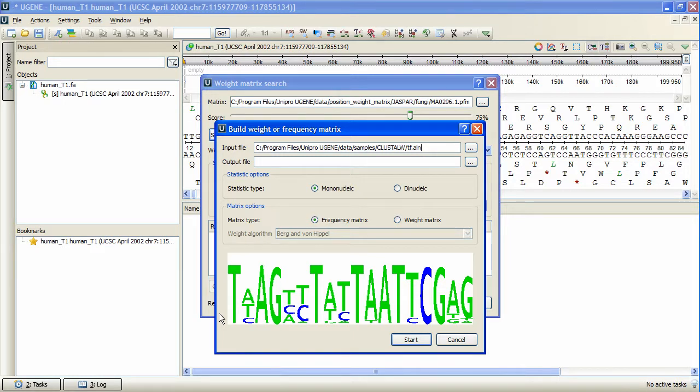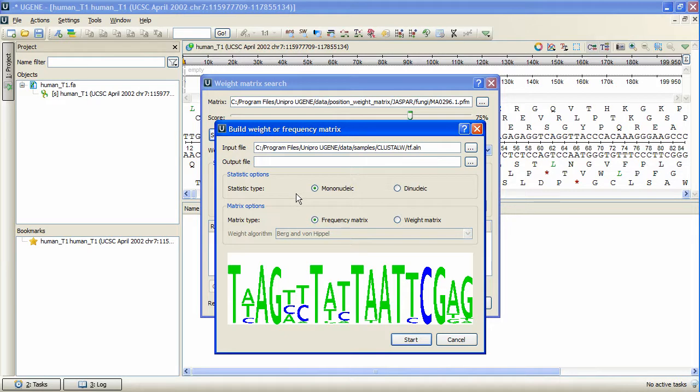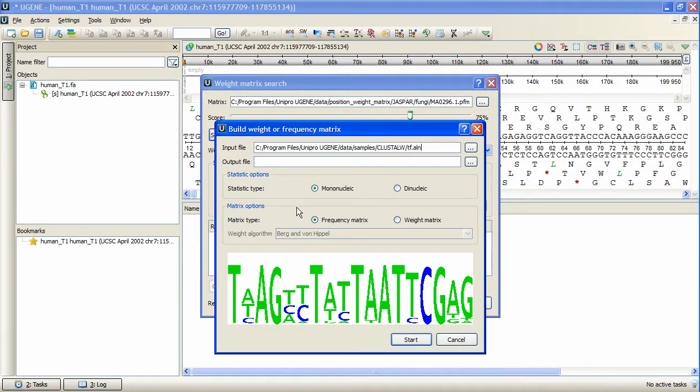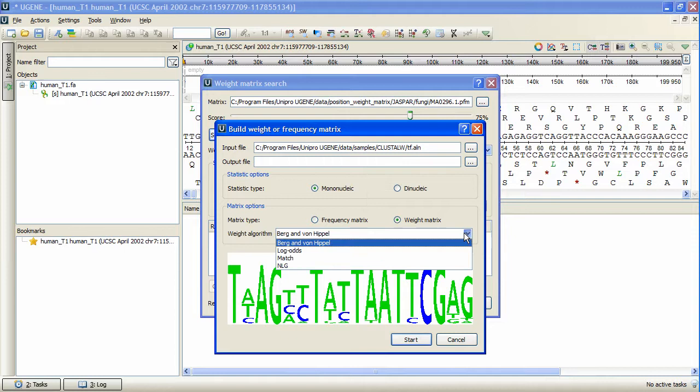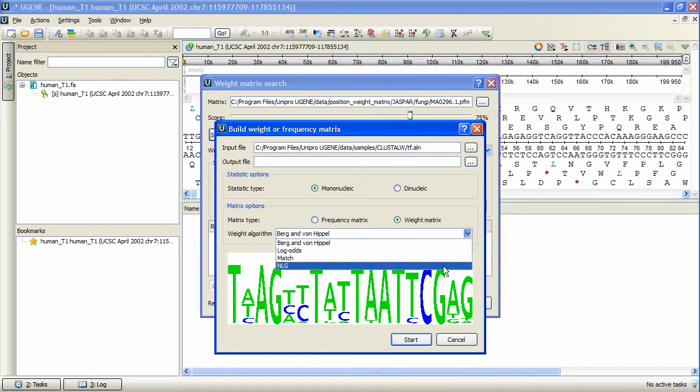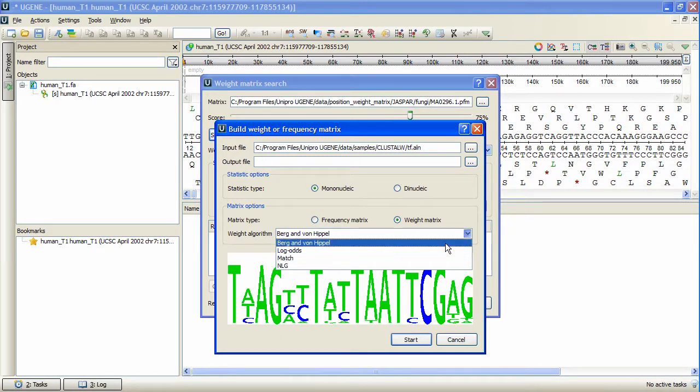Now we need to specify the build parameters. Statistic type defines the way in which the statistics will be collected: by subsequences of length 1 for the mononucleotide option, or of length 2 for the dinucleotide option. The resulting matrix can be of the frequency type, or of the weight type. In the latter case, we will need to specify the algorithm to transform the intermediate frequency matrix into the resulting weight matrix.